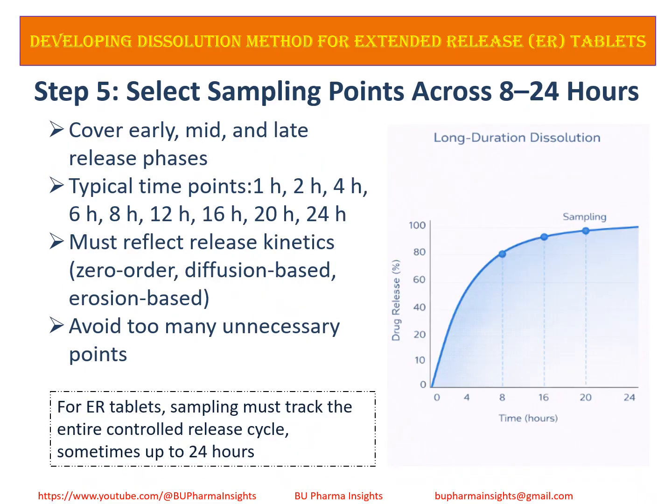Sampling time points must match the release mechanism. For osmotic systems, hourly or evenly spaced time points are important to confirm linear zero order release. For erosion control systems, more frequent early sampling is needed to capture initial matrix breakdown.